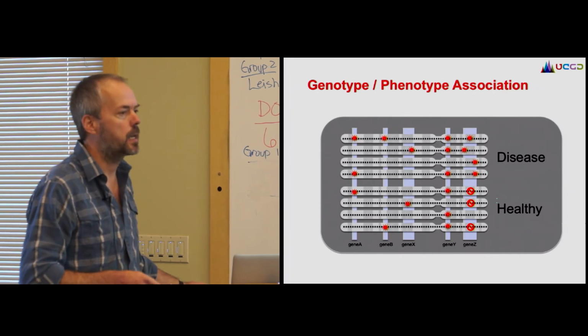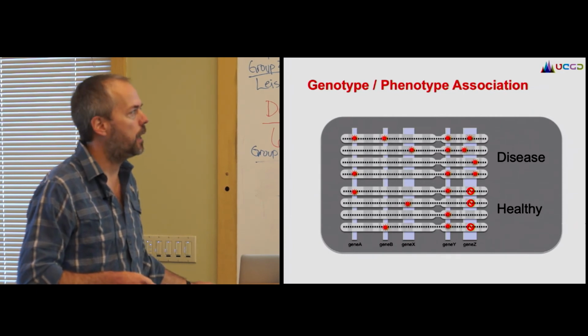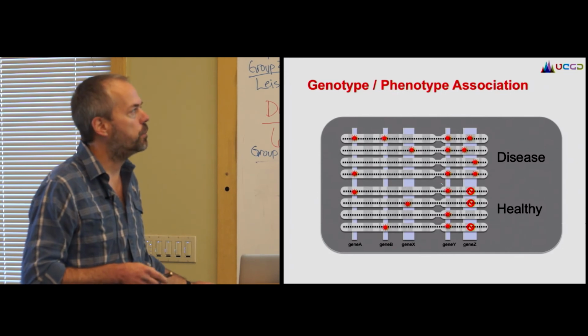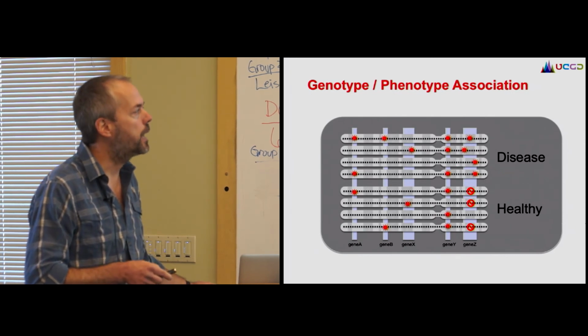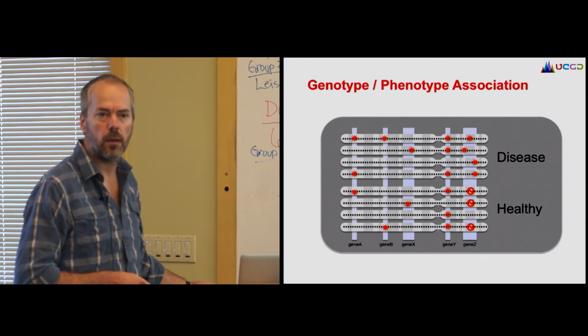For healthy genomes, we got this from a colleague who had done a different kind of capture, and that capture didn't capture so well in this region. If we aren't careful about how we process this data, that lack of information there could lead us to conclude that this is actually our candidate, when in fact what we really have here is just some missing data, and we didn't know that.